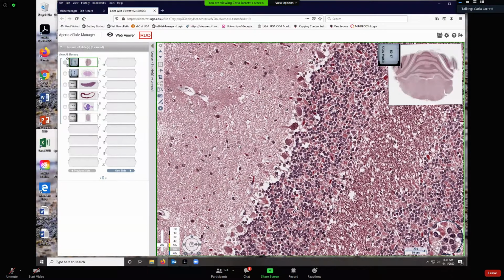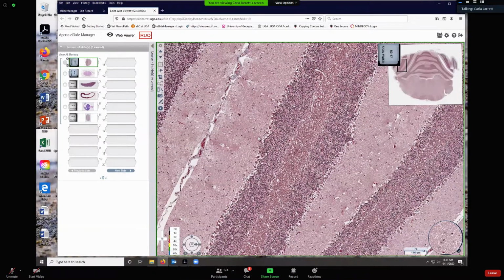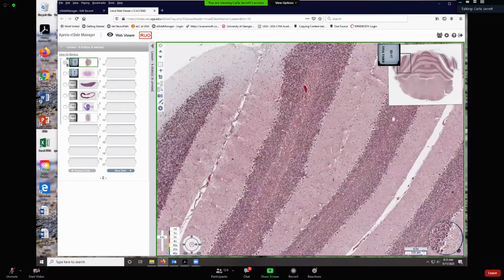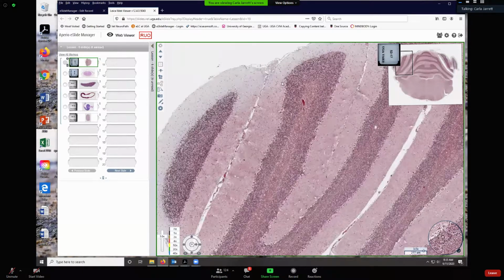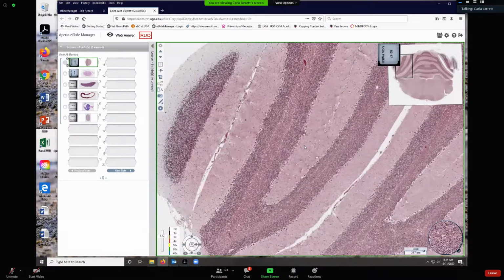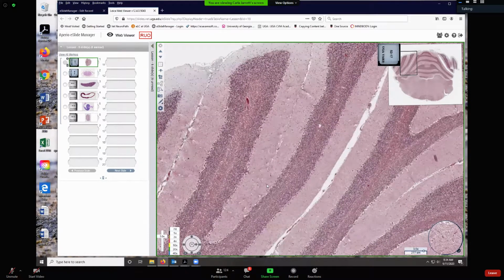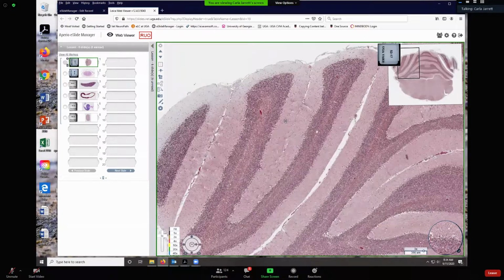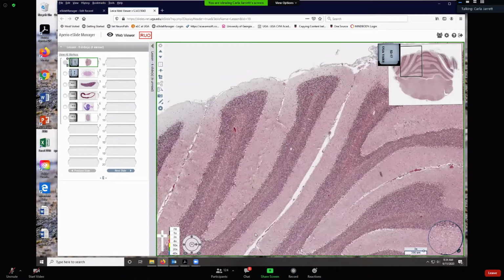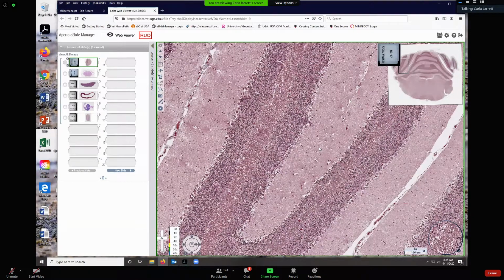Well, under that molecular layer, and because we have folds or folia, here's that molecular outward projecting folium and then coming back down, lining that sulcus of that first folium. And then we're going to take a hairpin turn here. And ooh, it says my internet connection is unstable. That's not cool. And then that molecular layer is coming back up, bending around and coming back down again. So that's another folium.